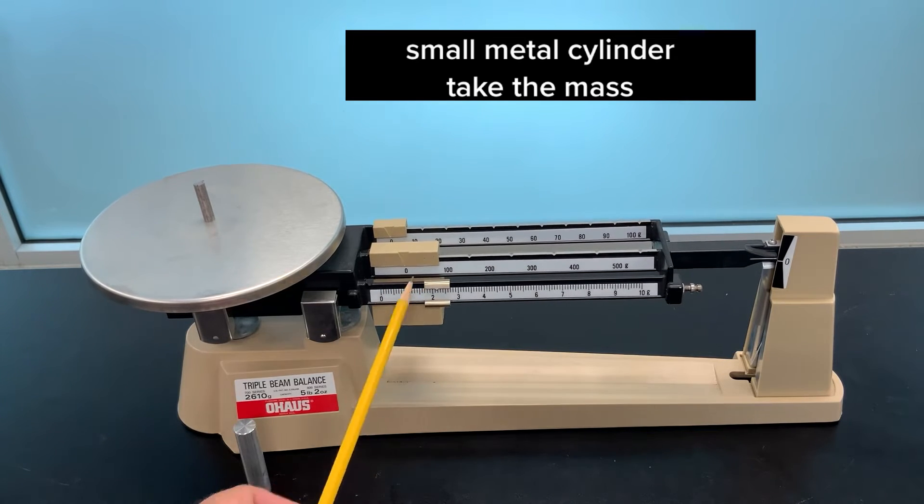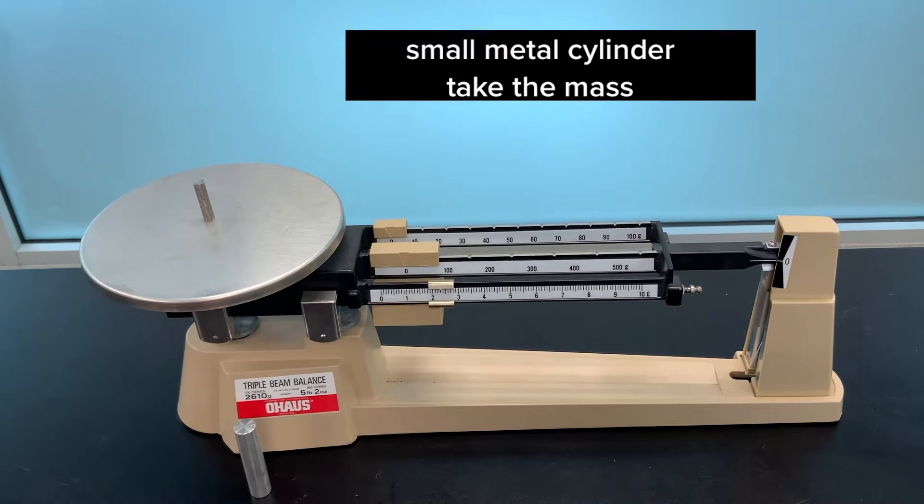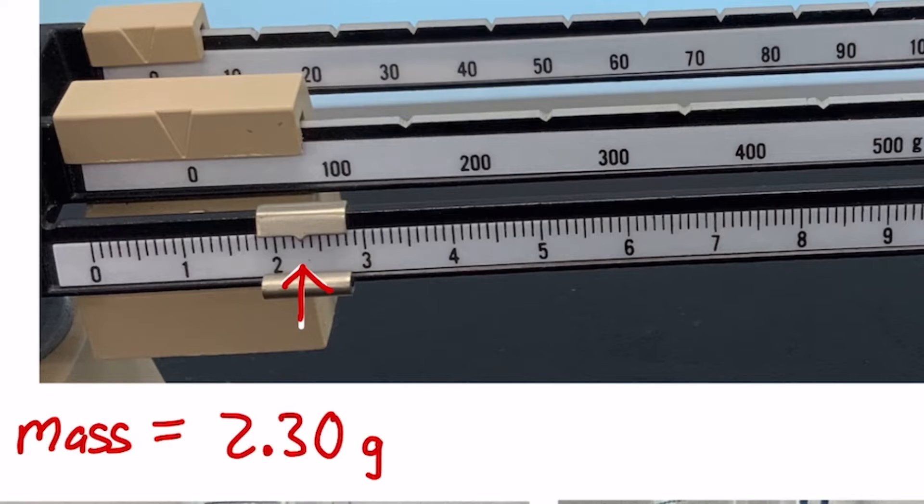The smaller object, again taking the mass, and the mass of the smaller object is 2.30 grams.